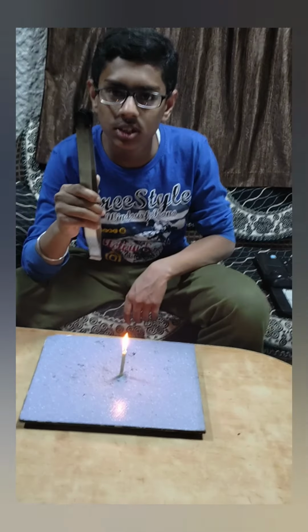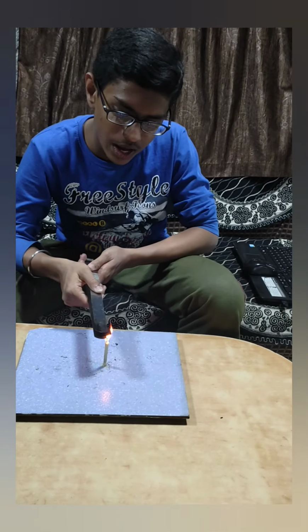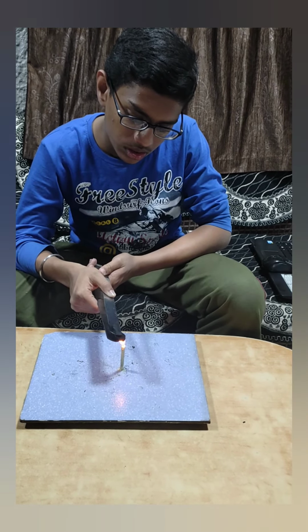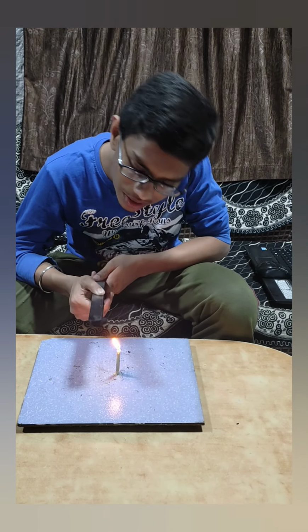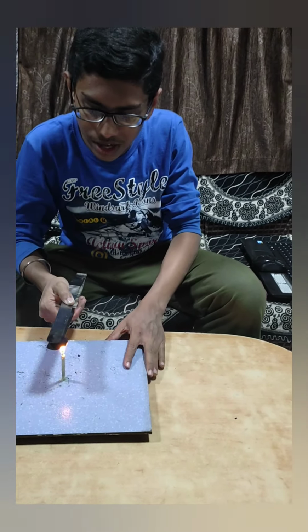Our next substance is this coal piece, and the coal piece's ignition temperature is very high, so it will take time to burn. It started burning. After a long time, I have seen some red particles burning in this coal, it will take a lot of time for burning, so we can write that charcoal is a combustible substance. So I am writing here yes, it's a combustible substance.